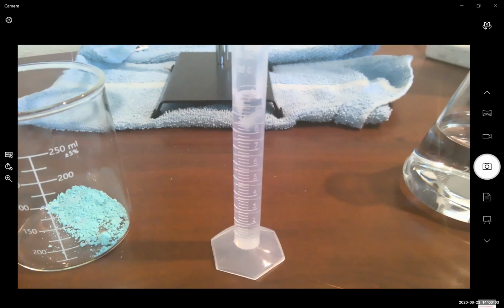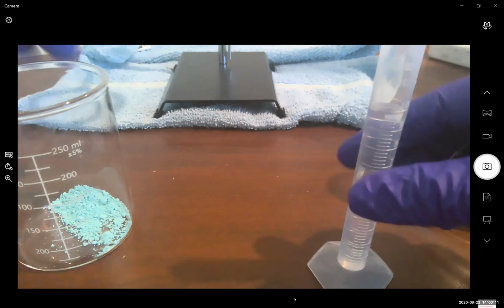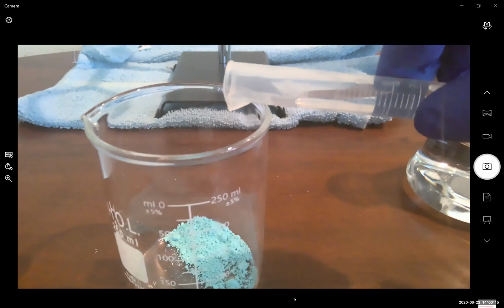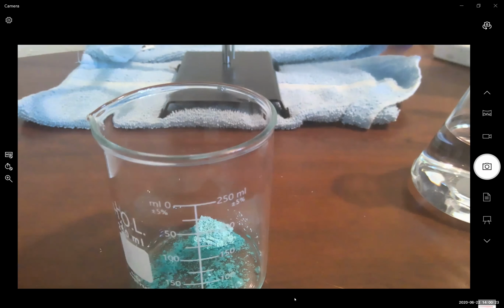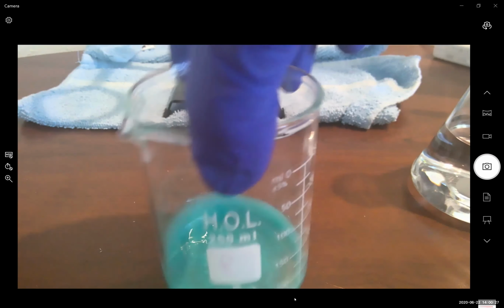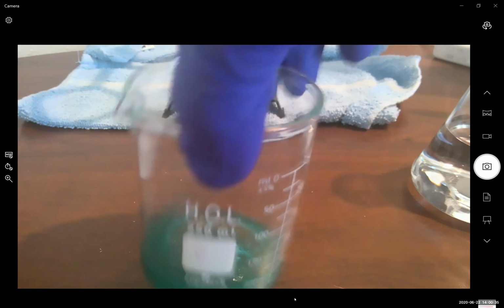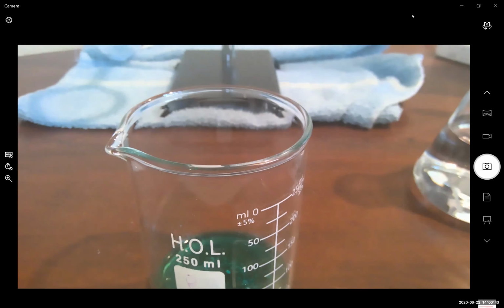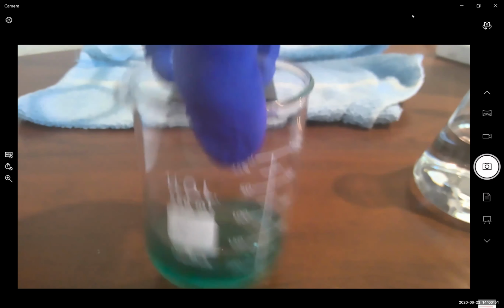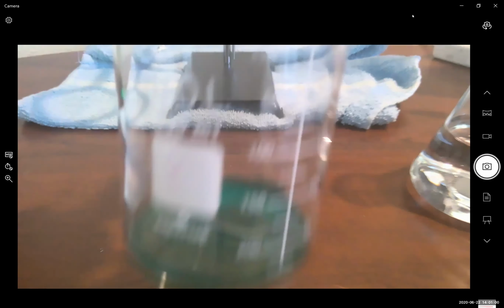And now we are going to pour this 10 milliliters of 0.5% sodium chloride into our copper gluconate. Now, we're going to gently swirl this solution to get as much of the copper gluconate to dissolve as possible. We're going to continue to stir our copper gluconate solution. Not all of the solid will dissolve, but most of the solid should dissolve. And you should see this beautiful green solution.